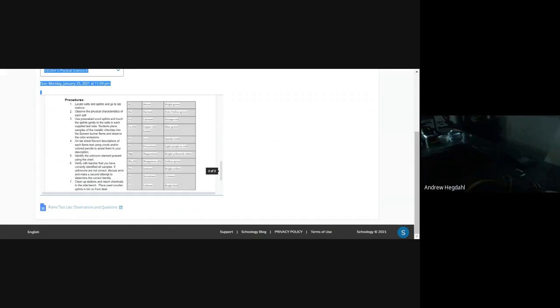Get into four groups, sorry, because I'm going to keep a sample up here to work with Maddie and Marley. So Maddie and Marley, you guys have your labs open? Okay. So I'll get set up here, and the first thing I'll do is turn on the lights, and we'll describe the different salts, and then I'll turn off the lights, and we'll start doing the flame test part.